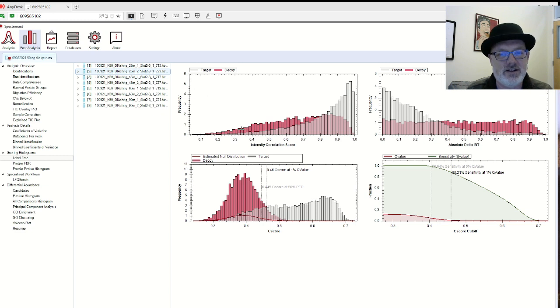I've never really been a biologist, so this is interesting to me. But if you want to know how the tests work and how it's segregating decoys, a lot of things in proteomics feed it false data. The decoys are fake signals or fake peptides, and they try to extract the signals from it. And this tries to separate the good data from things that are known bad, from things that we think are good.